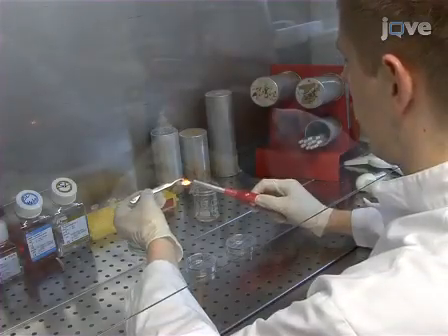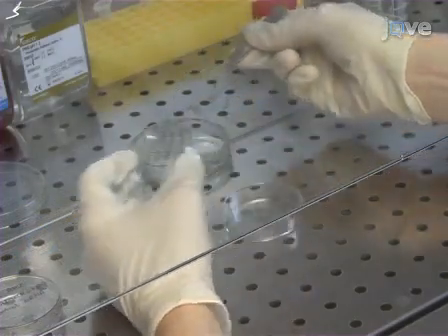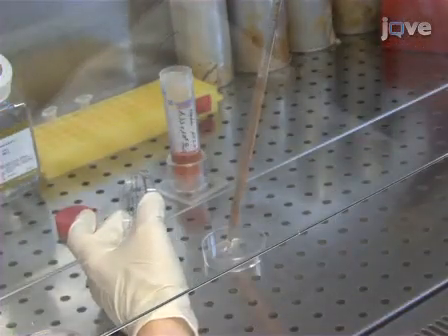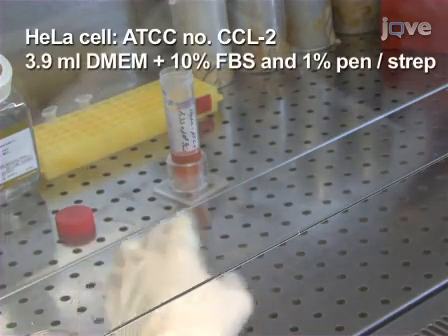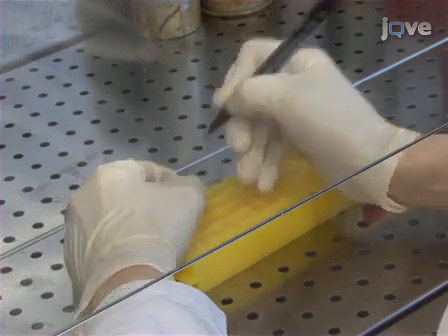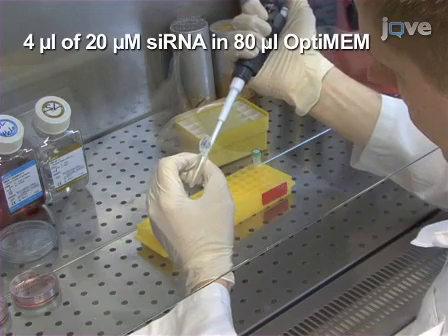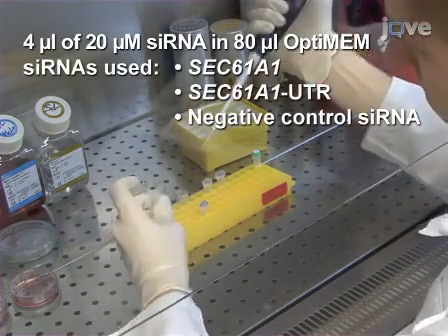To perform transfections in HeLa cells, prepare the cells for the transfection by placing a 25 mm poly-L-lysine-coated cover slip in one 6 cm cell culture dish for each transfection. After 1 hour, add 5.2 × 10^5 HeLa cells in supplemented DMEM to each dish. To transfect the cells, label 1 microcentrifuge tube for each transfection reaction. To each tube, add 4 microliters of 20 micromolar siRNA dissolved in 80 microliters of Opti-MEM. Here, Sec61A1, Sec61A1 UTR, and negative control siRNAs are prepared.